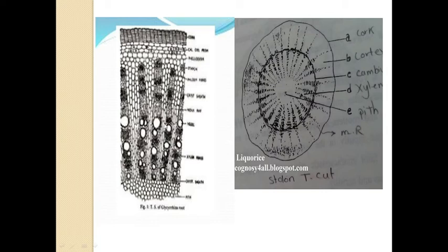Then this portion is known as xylem vessel. Xylem vessel is made up of xylem fiber, xylem vessel, and xylem parenchymatous cells. The vessels are about 80 to 200 microns in diameter. These vessels occur singly or they occur in groups.